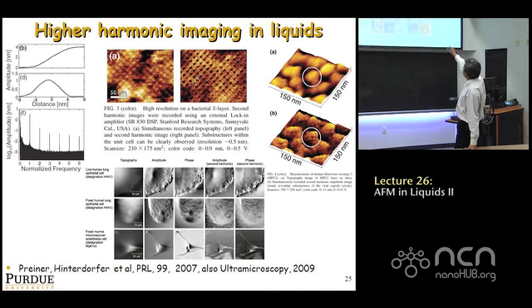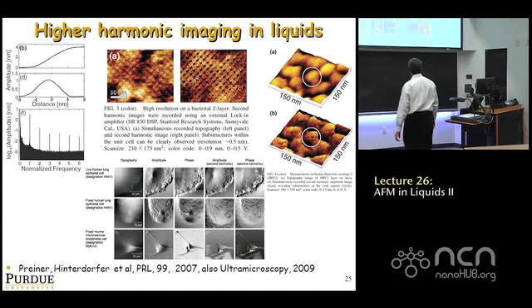You get phase contrast. The second harmonic gives you some contrast as well. What they found, interestingly, is that it's when they looked at the fixed cell, the second row, that the second harmonic really started showing some very nice features. But for the live cell, if you look at the second harmonic image, you did see some contrast, but one can argue it's not any more or less than phase contrast. It's really not much more. But for fixed cells, you could pick up a lot of interesting features with it.